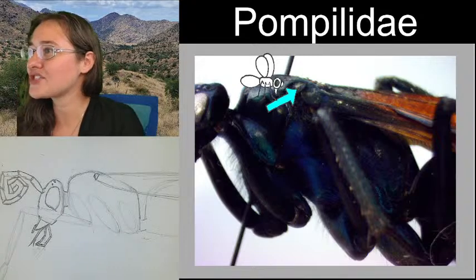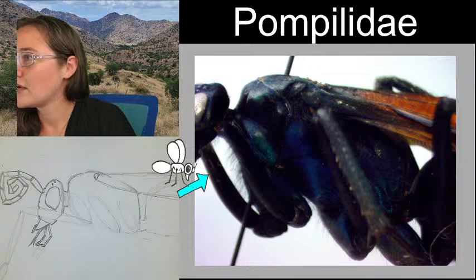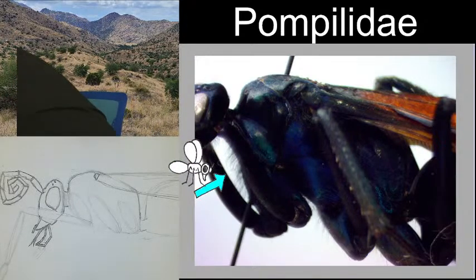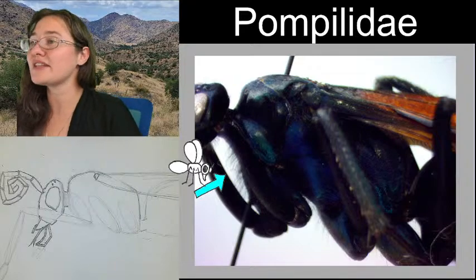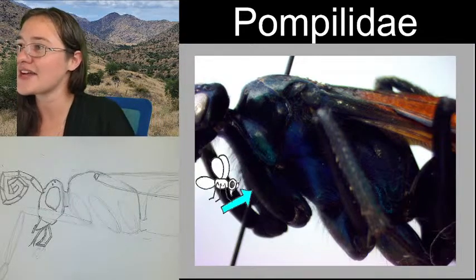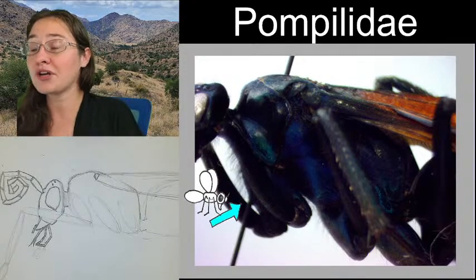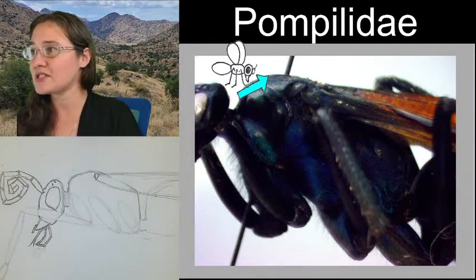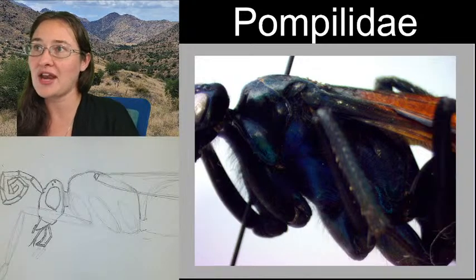Are the hairs on the thorax just on the front, or all over the thorax? I believe that those hairs are... He's got hairs. He definitely has a little bit of hair all over the thorax. It's not just up here. It is most obvious up here, and the hairs are more common on the ventral side of its body. Up on the top, you can see it's nice and smooth, so there aren't a lot of hairs up here. But on the legs and on the bottom side of the body, you have a lot of hairs.